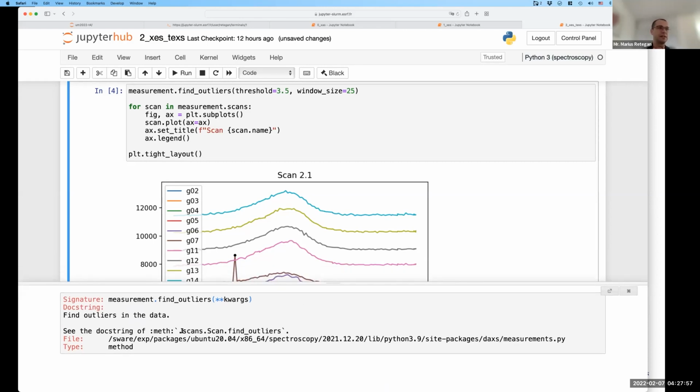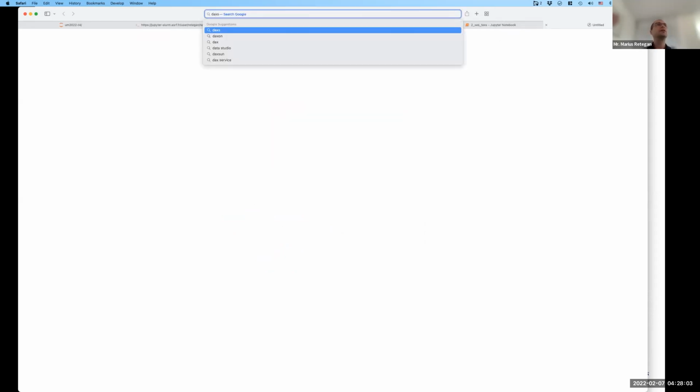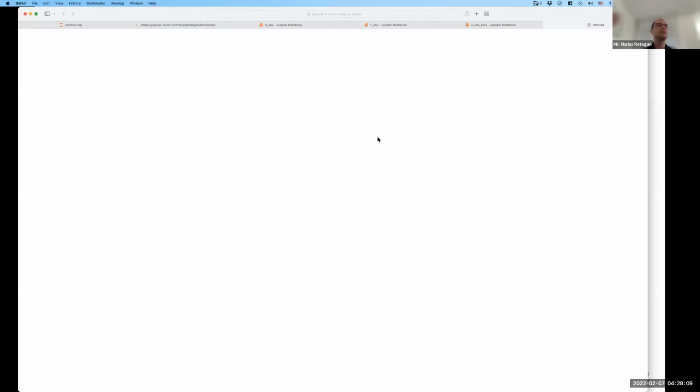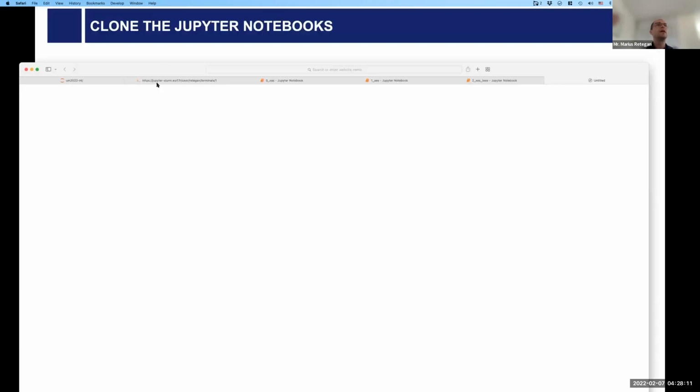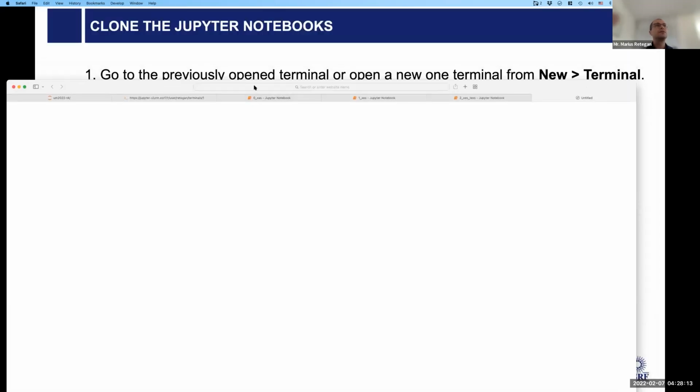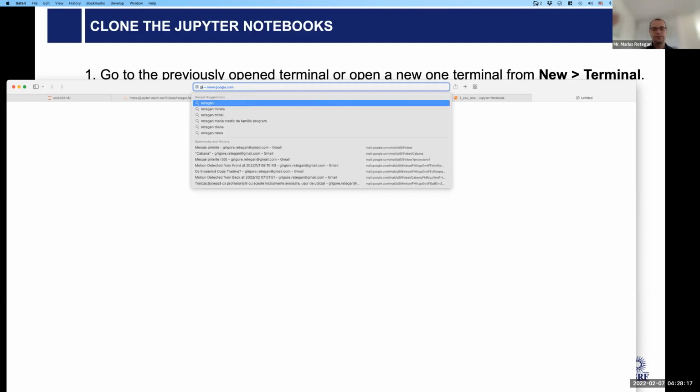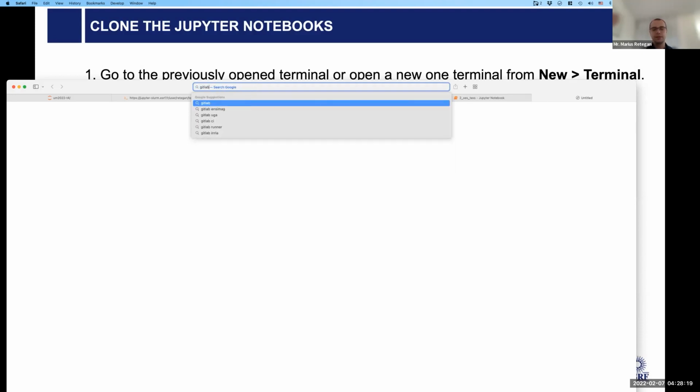Maybe this was not the best place, but there is also online documentation. So let me see if I can quickly find the website.